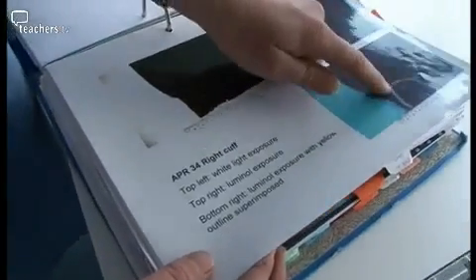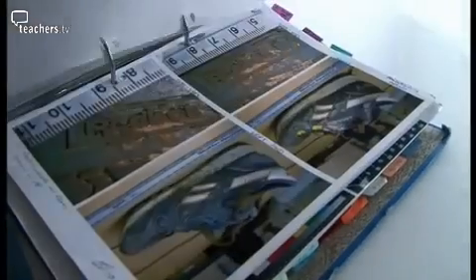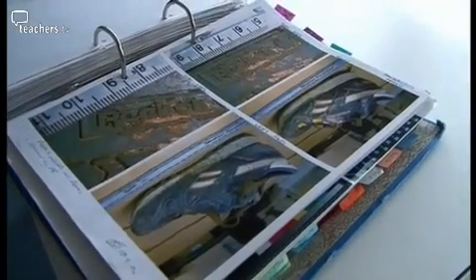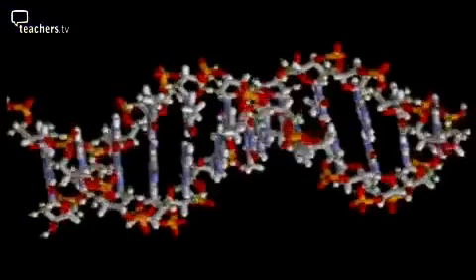The yellow crayon shows where we'd found blood originally, and there's some luminescence within that area. The use of luminol had identified bloodstains previously overlooked. This is a diagram of the right training shoe. We looked at a pair of shoes from one of the suspects and we found a blood stain on one of his training shoes. Now these two blood stains were then put in for DNA profiling tests. So that's one on the trainer and one from the sweatshirt.